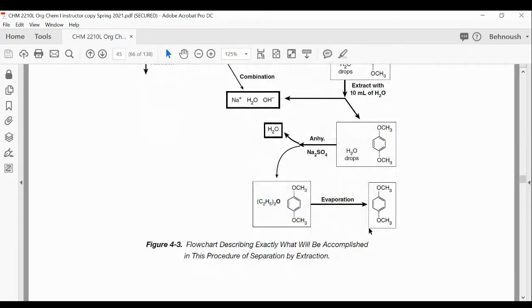Okay, let me go to the chat room to look at your questions. I am kind of done with the explanation about the theory, but I want to answer your questions. Then I will ask you questions. Is there a possibility of adding too little solvent and the solvent being oversaturated and not extracting all of the compounds?